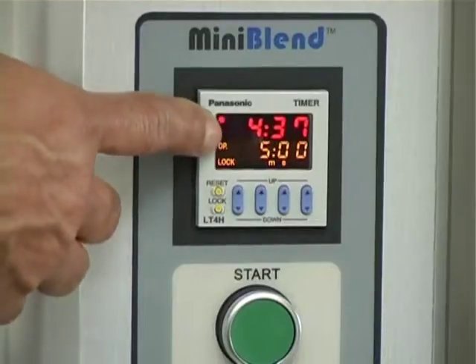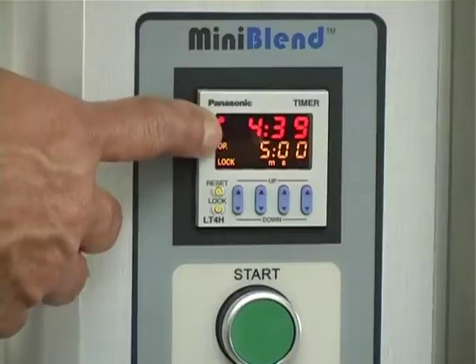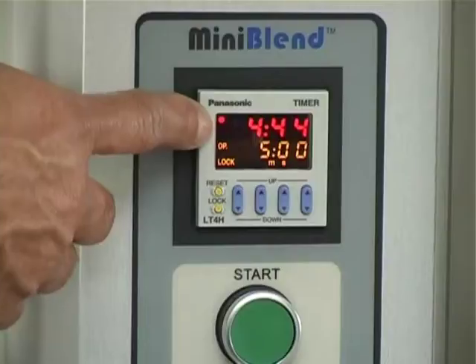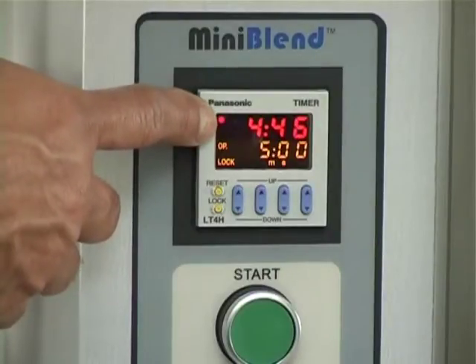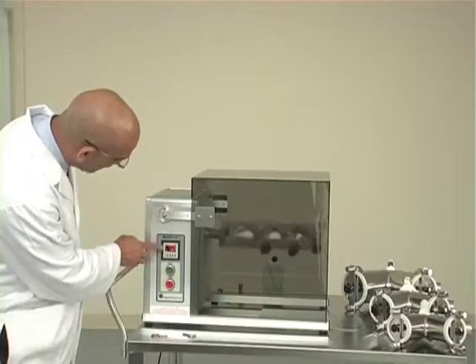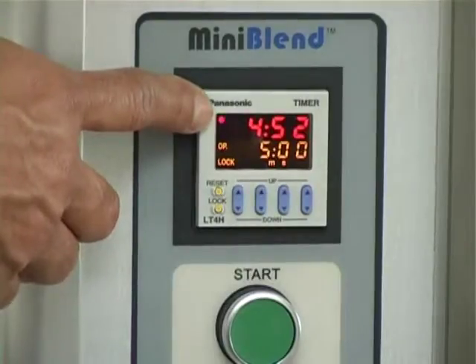The timer also displays the elapsed time. For example, right now it is 4 minutes and 44 seconds, so 16 seconds are left to complete the 5-minute blending time which we set.